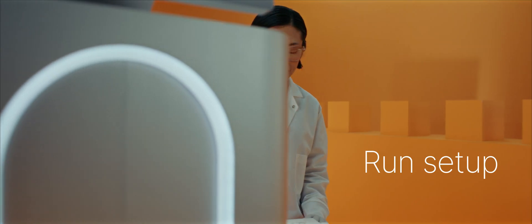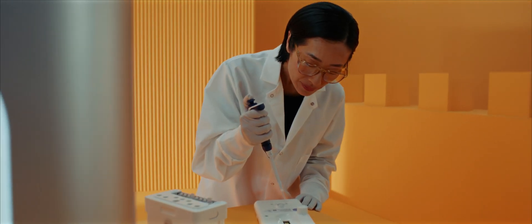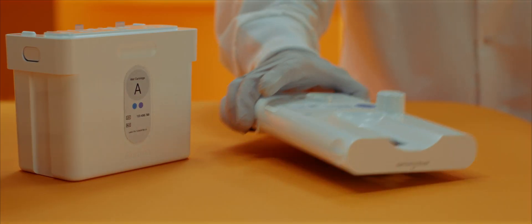Run setup is performed in three steps: dilute libraries, add denaturation buffer, load the cartridge.